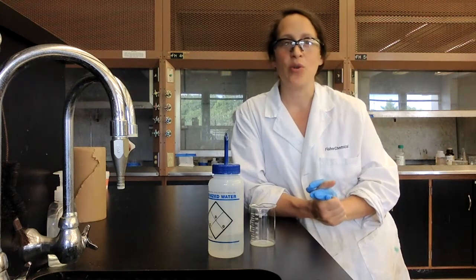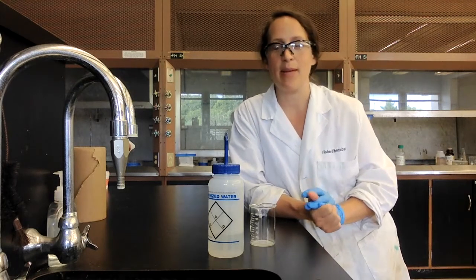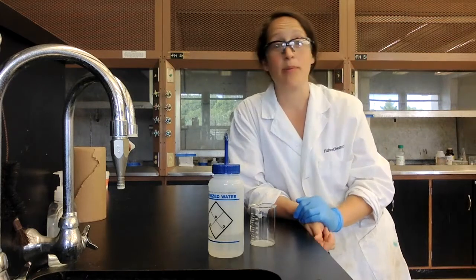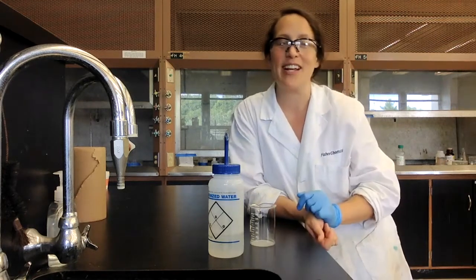I will just say, in short, 99% of the time use deionized water, probably 100% of the time. It's always safe to use deionized water.